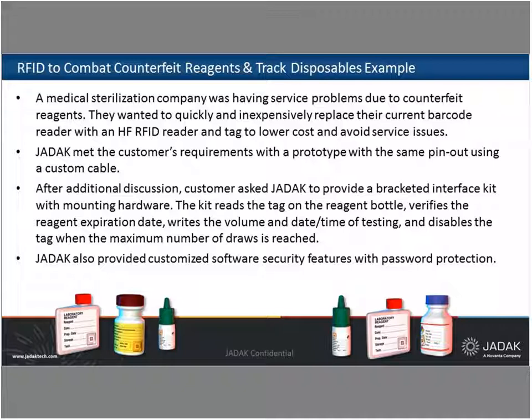So JADAK created a prototype for a proof of concept that was a drop-in replacement using the same cable connections. We did software on the device that mimicked the barcode reader protocols, and also a bracket so that the samples, when they were placed in the device, were placed in the same way, thus eliminating rework and training. So they're going to use the device exactly the same way they used it before. And this minimized the impact of changes that needed to be made on the host side.